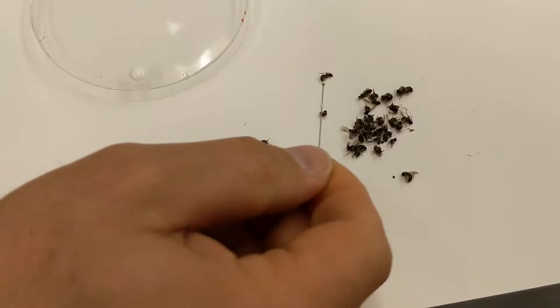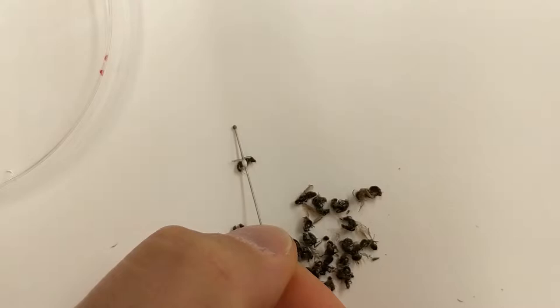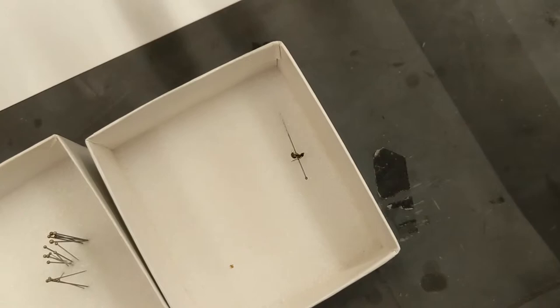Now I'm going to find a bee that's laying on its left hand side and I'm going to glue it. Holding the tip of the pin on the table, I'm just going to press the glue onto the side — the middle of the bee — and then I'm going to take the specimen and pin it on a high angle into the little box.